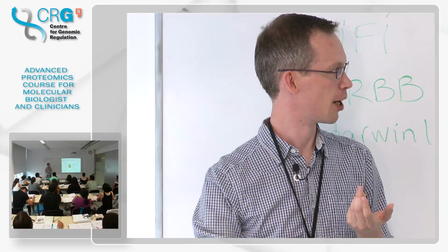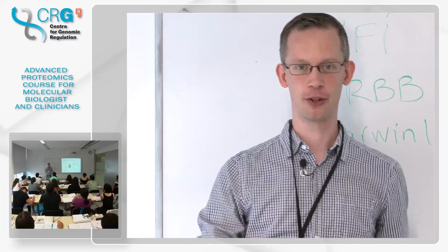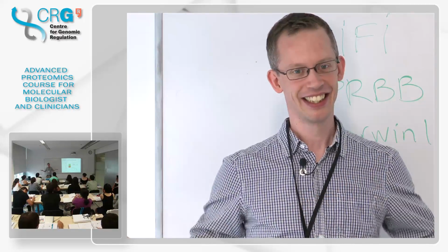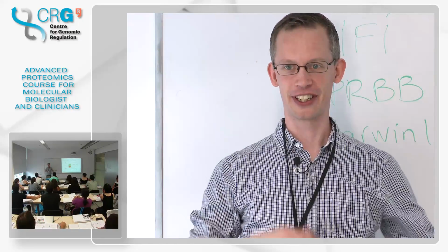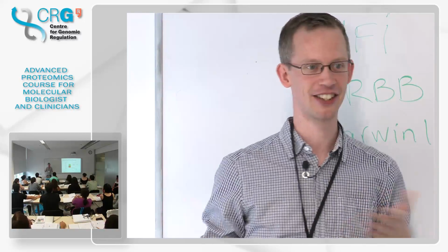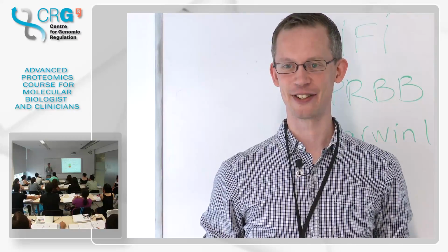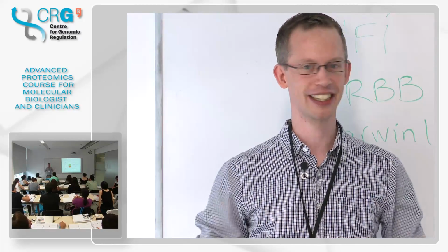in the decoy. I've also had a case where a colleague of mine borrowed a buffer, and all of a sudden all my samples had yeast in them, and I was working with human samples. I didn't assign anything correctly because the database I was using was not the right one, since it was a yeast sample and I just didn't know it. So this then captured it and said, hey, there's something really wrong here, I can't assign my spectra.